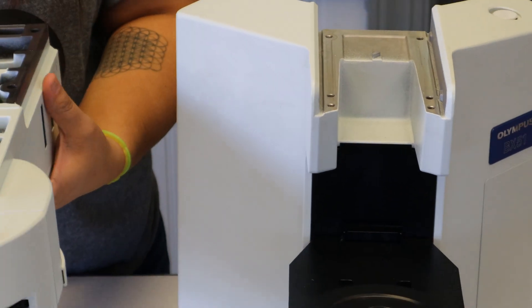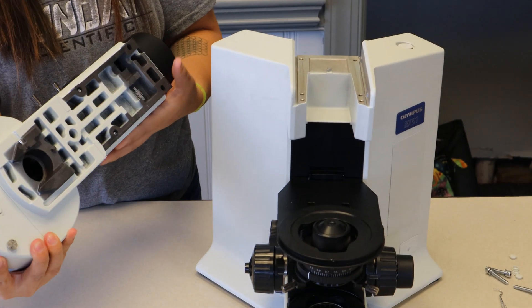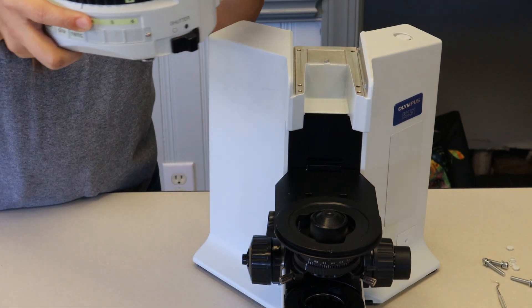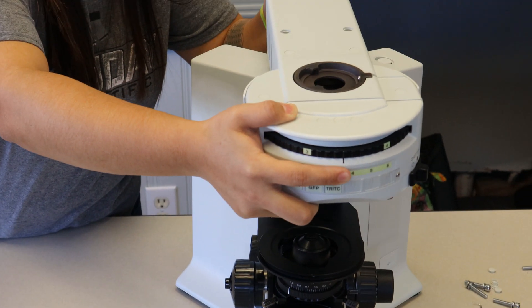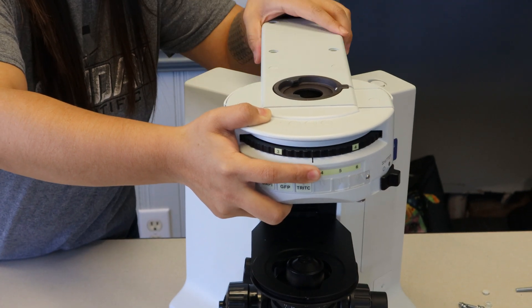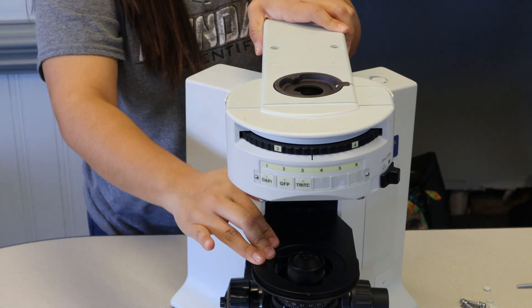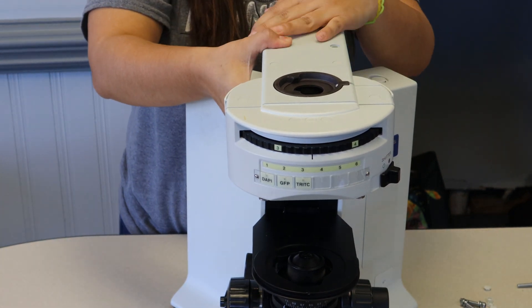So when you place the illuminator on top of the stand, you want to line those two up and then pull it to the back, to the right, or push it to the back and the right in your case. That way everything will line up as it's supposed to and everything will be aligned for when you start attaching your objectives and things like that.